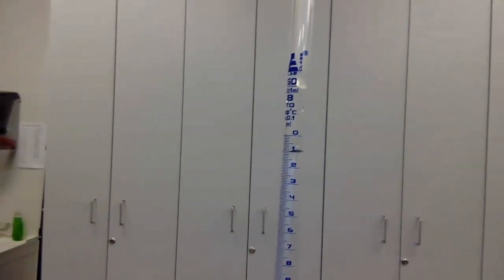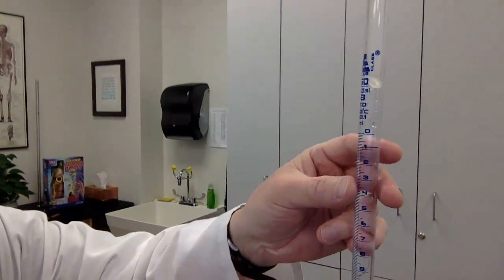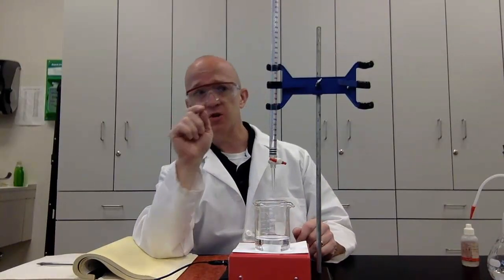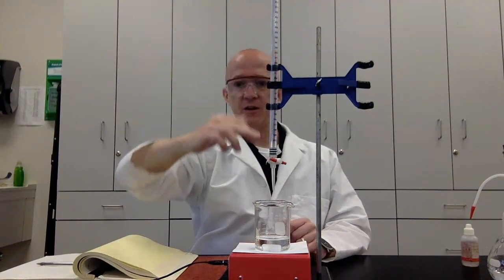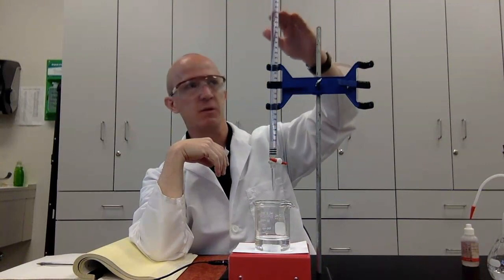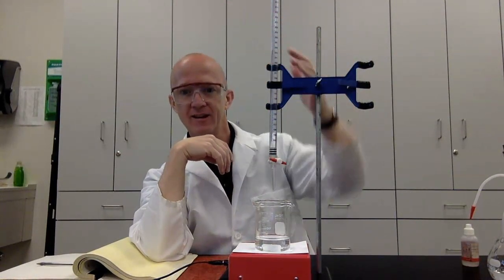I'm going to show you where my volume is at this point, and you can see it's really close to 1 milliliter. I'm going to say that this is 0.96 milliliters. Oh, by the way, you may have noticed this, but I want to make sure to point it out. These numbers go from 0 to 50 and not 50 to 0. That's because since I'm releasing the solution, it's going to be moving this way, isn't it? So I want to be able to count upwards and not backwards.